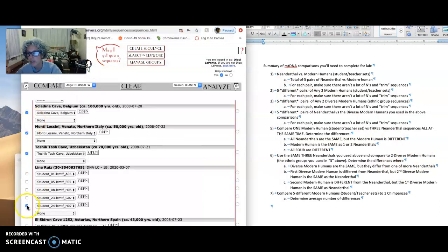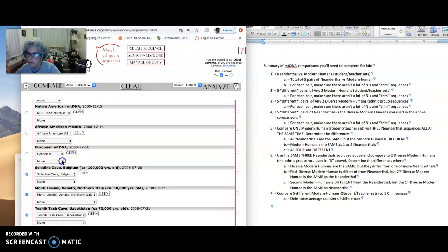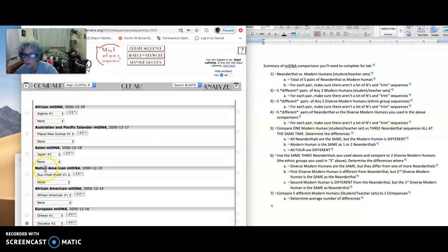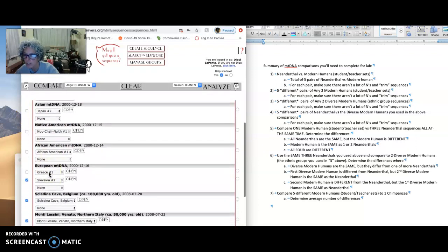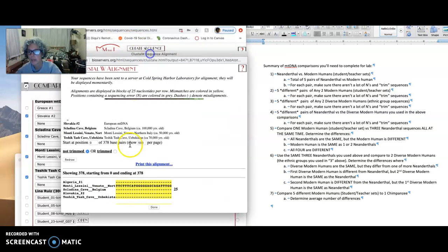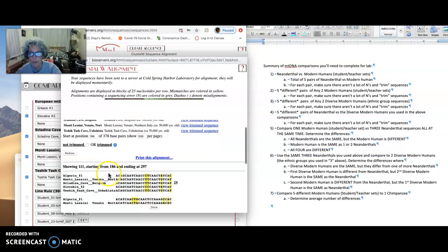So those are my same 3 Neanderthals, and I've got Belgium, Italy, and Uzbekistan. So I don't have, do I have an Italy? I've got Greece, Finland, Switzerland, Spain. Oh, I'll just pick that one, and why not an African? So now I've got an African, a European, and 3 Neanderthals, and I will compare them. Once again, trim it, redraw it, and I get 111 base pairs.